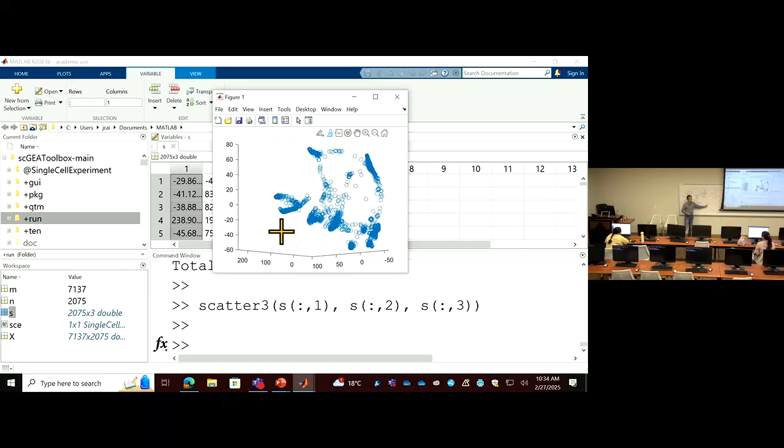Okay, so what do we need for a k-means program like this to run? We need the coordinates, the data, and we need a hyperparameter, which is a number k. So we need to give k-means a number. From here, I see, okay, we can give 5, 7 maybe.